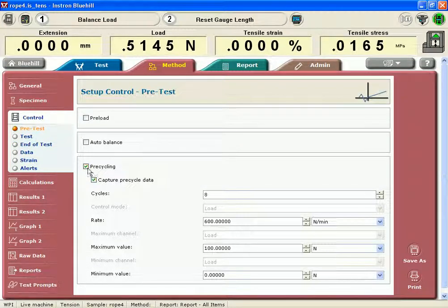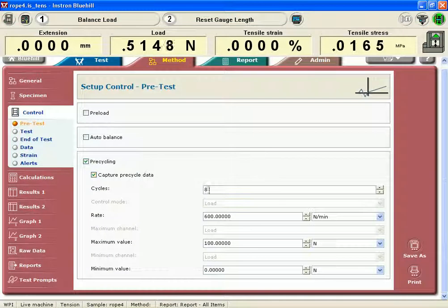And a pre-testing with pre-cycling at 8 cycles at a rate of 600 newtons per minute, under load control, going to a maximum of 100 newtons and a minimum value of 0 newtons.